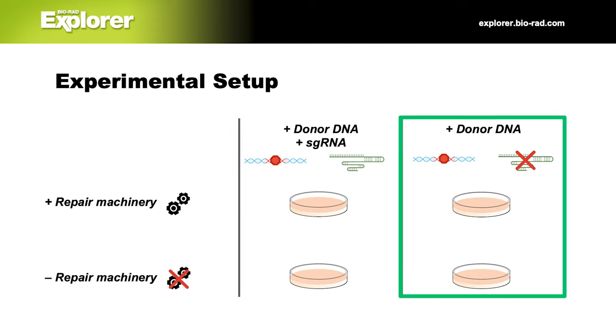Here's what you'll need for the lab. A permanent marker, 4 empty 2 mL tubes, 2 plasmids, PD and PDG, LB nutrient broth, a container for trash, a container with ice or ice water, transformation solution, kept on ice, 2 starter plates, with and without arabinose, labeled +Ara and -Ara, 4 experimental plates, labeled +Ara SPT. These have spectinomycin to select for transformed bacteria.